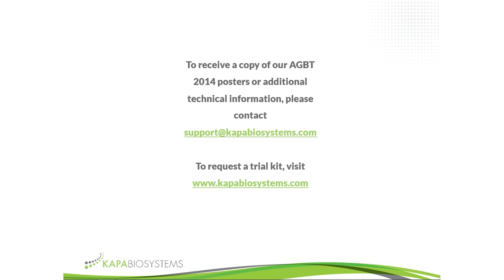And we provide some guidelines. Essentially, when you're buying oligos to make adapters, either buy your adapters from a reputable vendor or buy oligos that are HPLC purified. That means they have high molecular purity. And then it's very important that duplexing is done in an appropriate salt solution to make sure that the adapters stay duplexed as much as possible during library construction, especially for high throughput systems where adapters often spend an hour or two on deck without being cooled, and we do that regularly. But yes, the adapter quality plays a huge role in conversion rates.